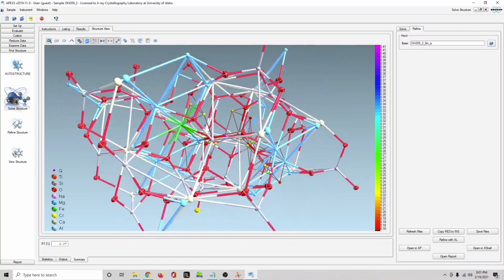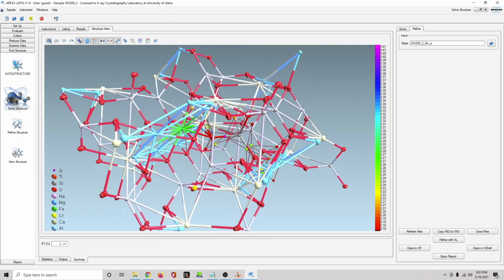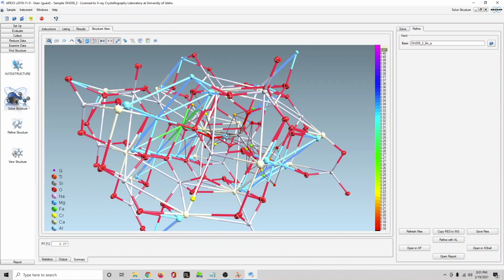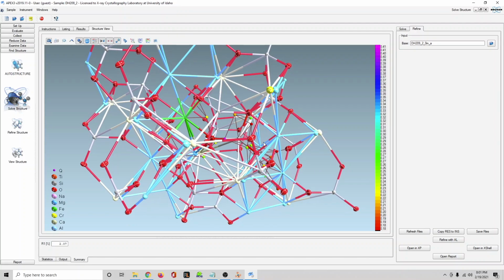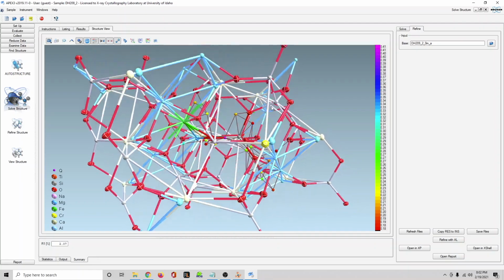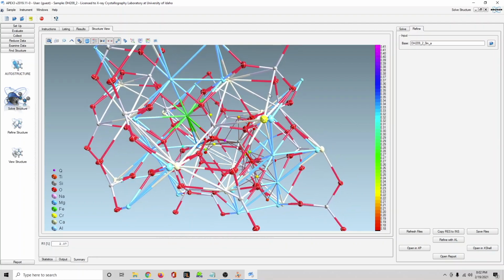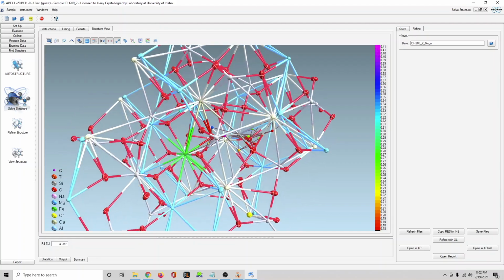Q1 is this weird peak, halfway between the tetrahedral site and the oxygen. So this is silicon and this is one of the bonded oxygens. And this is talked about in literature about pyroxenes. Actually, they think it's a sigma bond or a pi bond of some kind that's leading to some extra electron density. That's what I've read about it, but it's like always there. It could also just be an artifact of the Fourier synthesis, but that's what people have said, so we can't really do that much about it.